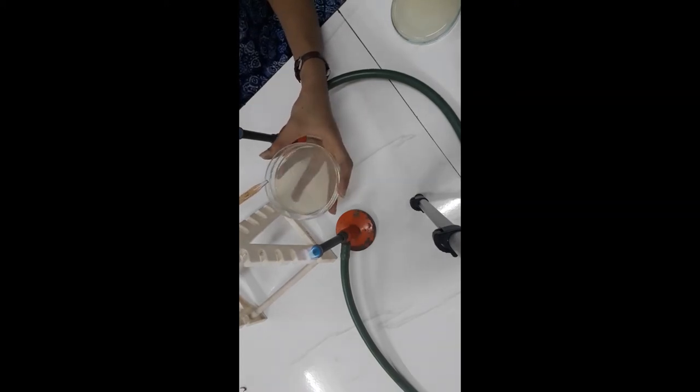Again, I have taken 1 ml of sample and I am going to add it onto a nutrient agar plate. Now I will start putting my spreader into alcohol and will be flame sterilizing it so that any organisms present on the spreader will now die off. And using this spreader, we will spread the water sample.